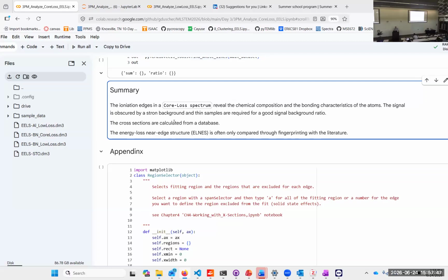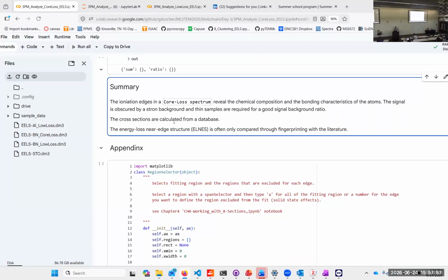So that's very important. And the strong background, you have to fit that. And I think fitting the spectrum is the key thing of doing that. If you do it with a nicely calibrated way, and it's standard, you can run that through many of the different spectra. You can do that through a spectrum image, and you get all the different features that are relevant.